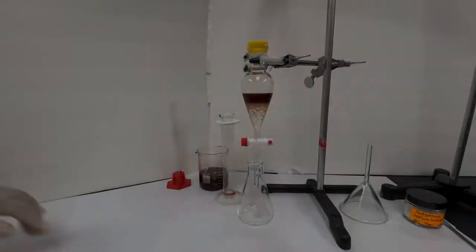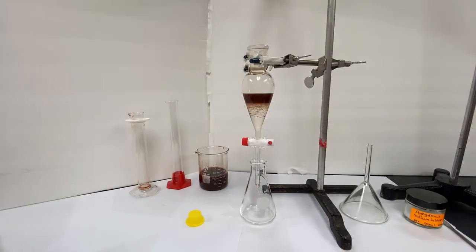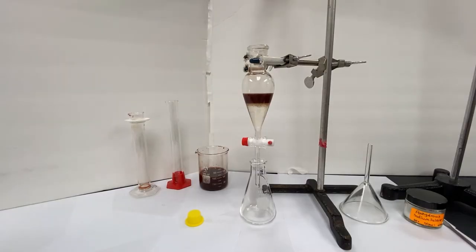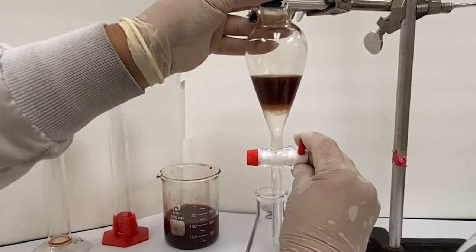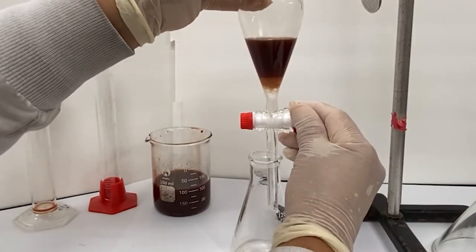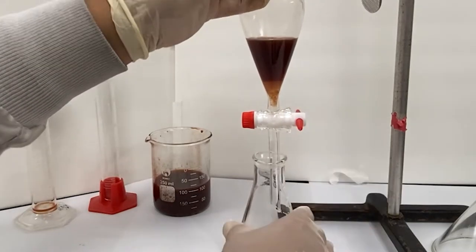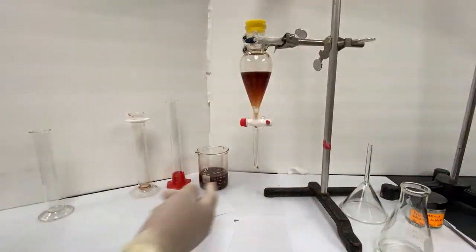This can take a few minutes, so be patient. If bubbles form between the layers, you can use a clean glass rod to pop the bubbles and speed the process up. Collect the bottom layer, which in this case is the organic layer, by opening the petcock and letting it drain into your collection vessel. You can collect it quickly at first, but be sure to slow down as the tea layer gets closer to the bottom. Repeat the extraction with DCM one to two more times, collecting into the same vessel.